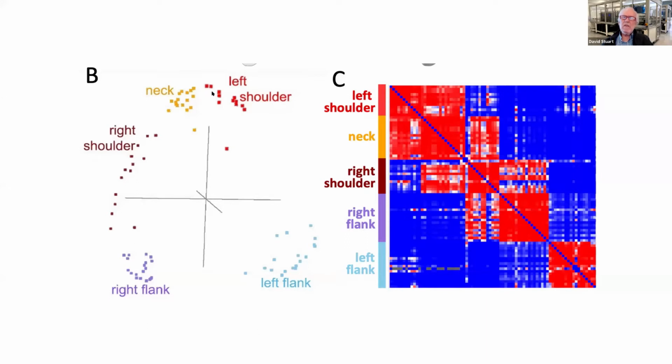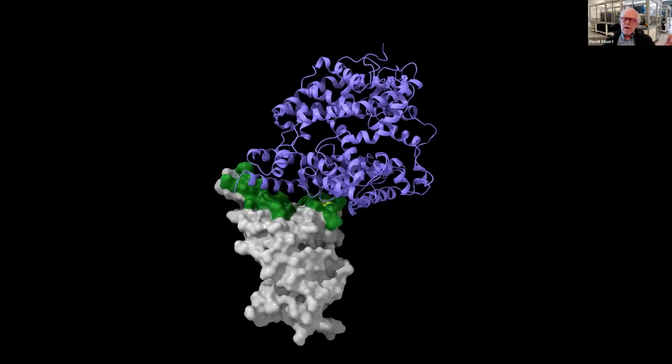You can see that there's this row that cross competes, forming this arc here in this hyperspace of the clustering algorithm. And then this left flank is separate. So these now, I've mapped these to the torso.